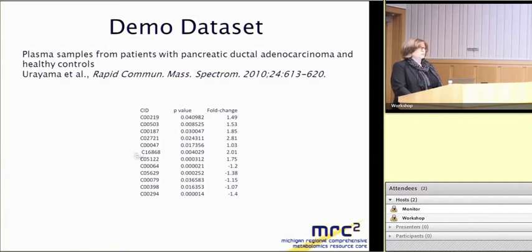So as you can see, it's basically a 3-column file. And so in this case, we're using KEGG ID to identify the compounds, but as I will show you, you can actually use compound names. The second column is p-value. In this case, since we had 2 groups, we used simple t-test, as I said. And fold change or log fold change can be loaded into the tool. And if you don't have fold change, or if you don't want to look at that for whatever reason, fewer visualization features will be available to you. So basically, this is optional, okay?